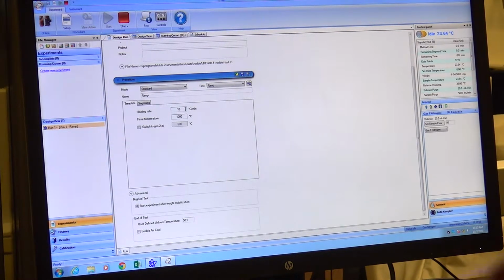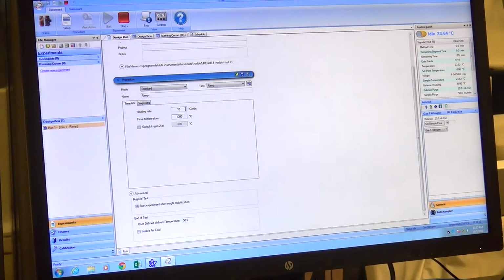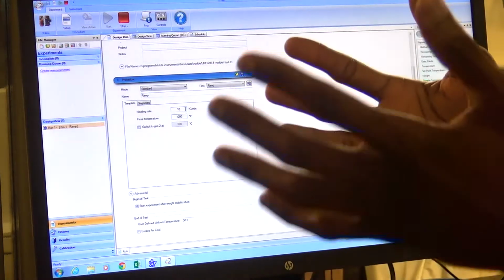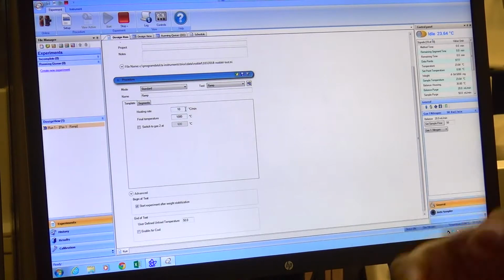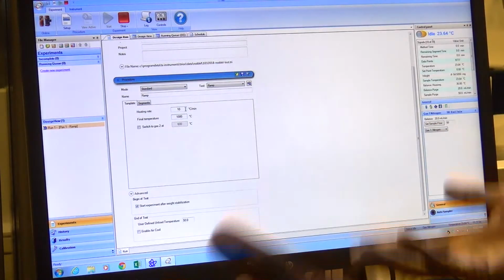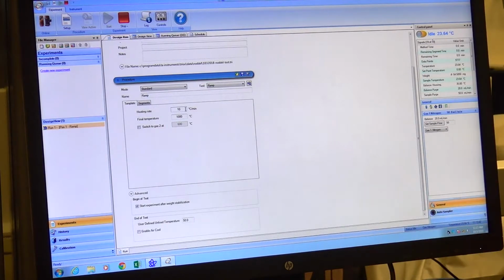Again, remember, like many thermal analysis instruments, your heating rate does shift transitions. So you want to have a reason to change your heating rate. You don't just randomly change your heating rate to save time or something like that. Changing your heating rate can shift where these transitions occur. So it's not one of those randomly chosen numbers. You should think about which number you want to start with. I suggest starting at 10 or 20. And then when you actually evaluate your data, then you can decide, did you see what you wanted to see, or do you need to slow down or speed up or what have you, okay? But definitely do not randomly pick this.